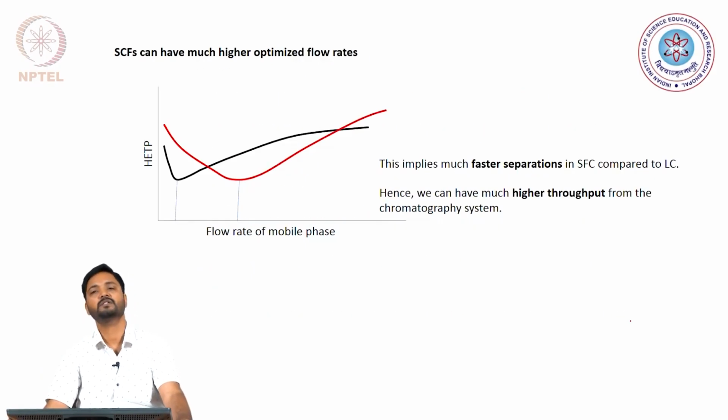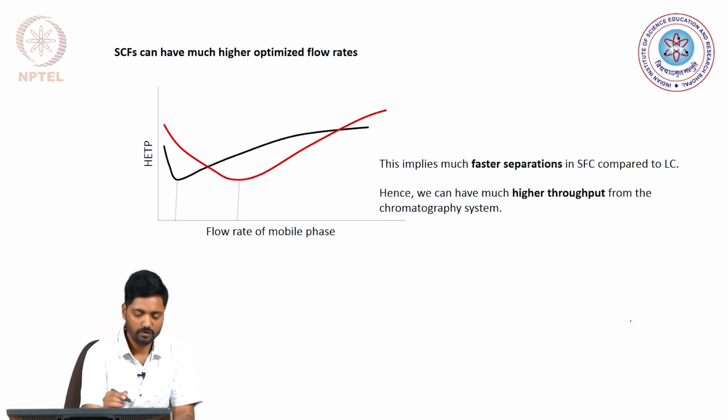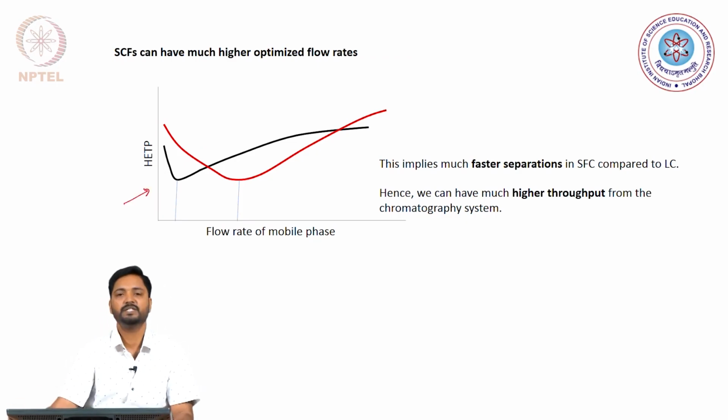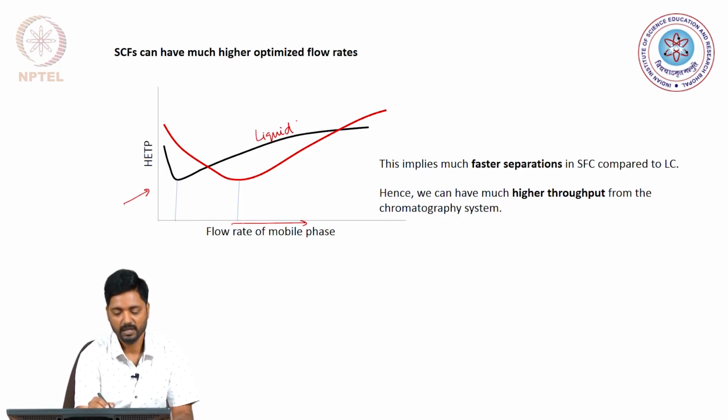So, let us move forward and compare how the improved flow rates of supercritical fluids are advantageous to us. Here I have plotted the change in the plate height with the flow rate of the mobile phase for liquid chromatography and for supercritical fluid chromatography.